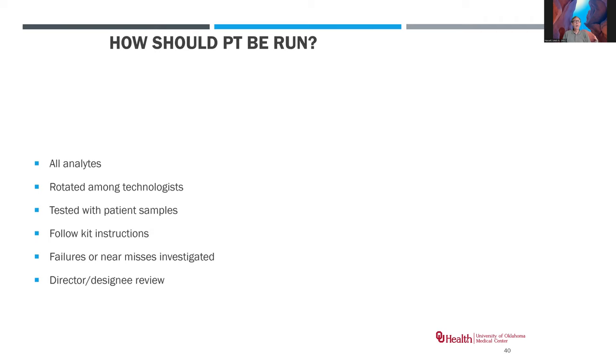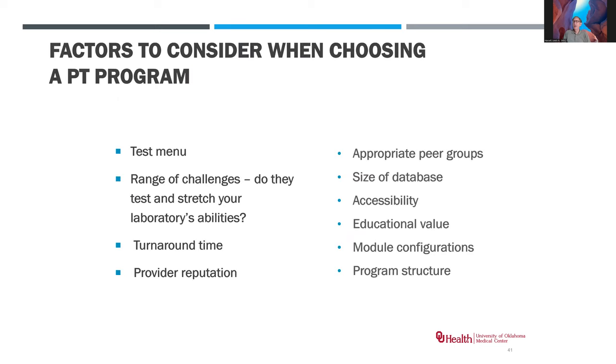So PT is intended to be run on all analytes. It is intended to be run by varying rotating groups of all technologists, not just your best one, but everybody participates in it. It's intended to be run concurrently with patient samples, according to the instructions, and whatever you miss or mess up on, you check into it and then review it, of course, with your director or his designee. So if you're going to choose a PT program, look at your test menu, what they offer.